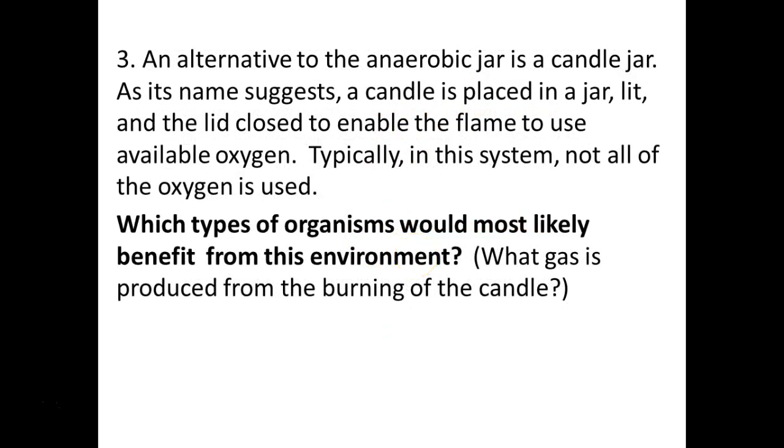An alternative to the anaerobic jar would be a candle jar, where you take a big jar, you stick a candle in it, you light it, you put your cultures in, and you close it up. What happens to the oxygen level in this? It decreases as the candle is burning. So who would be really happy in here? Not really anaerobes, because it's not going to remove all the oxygen.